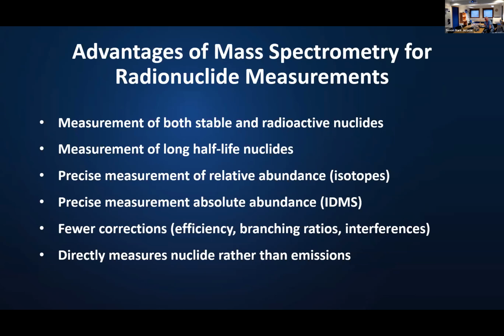It really does depend on what you're trying to measure and the final purpose of your measurement. In the chemistry regime, we're always looking for fit for purpose. We want to make sure that our measurements serve the community for which we are doing the measurement.